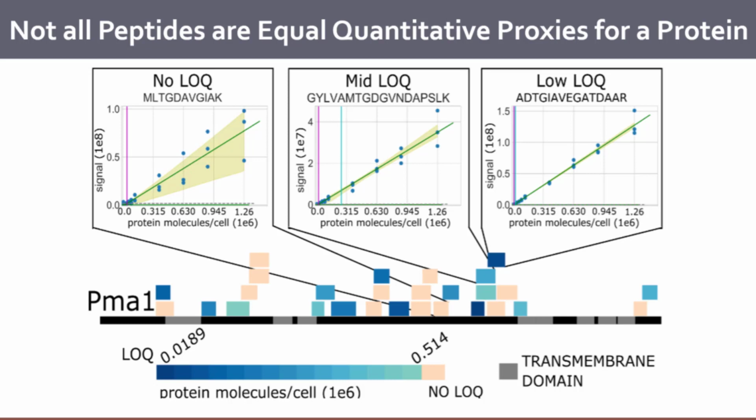A lot of times people just arbitrarily set like a 20% CV threshold for things, and that is definitely a much better starting point than just going straight with, it's detectable from some search tool.